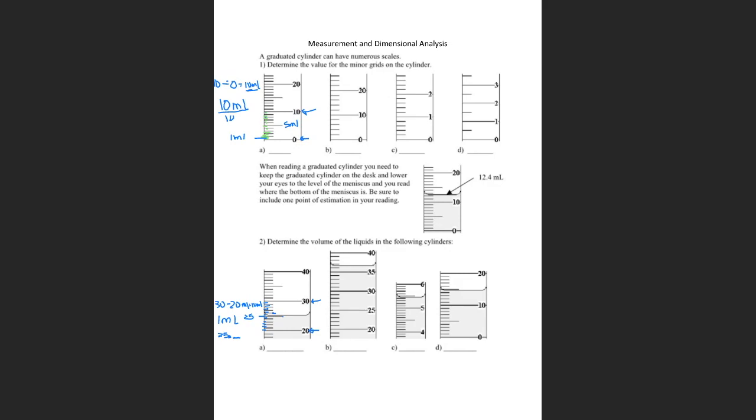What I'm going to do here, I'll say it looks more like 0.25, but I'll just say 0.3 to make it a lot easier. So I'll say 25.3 milliliters. It's difficult to write small in this mode here. 25.3 milliliters. Okay, so when it comes to the reading here, there are two numbers that are certain.